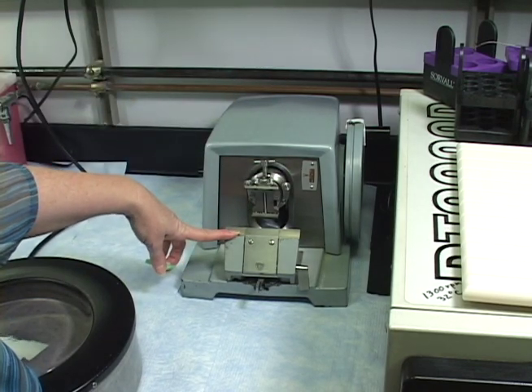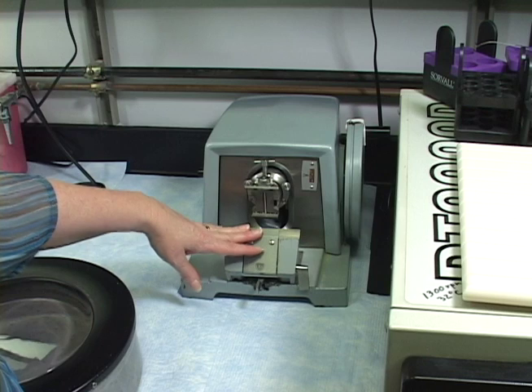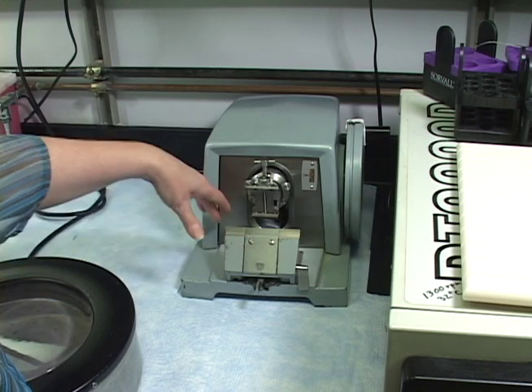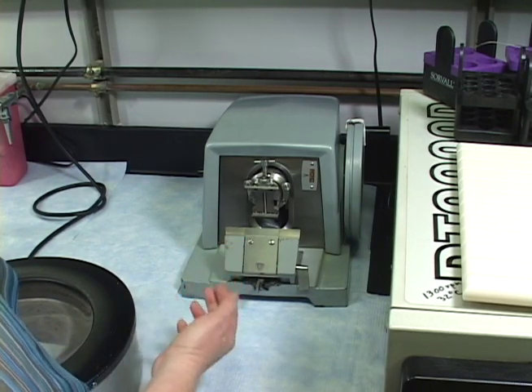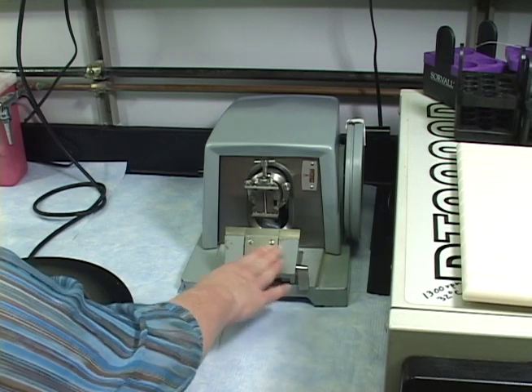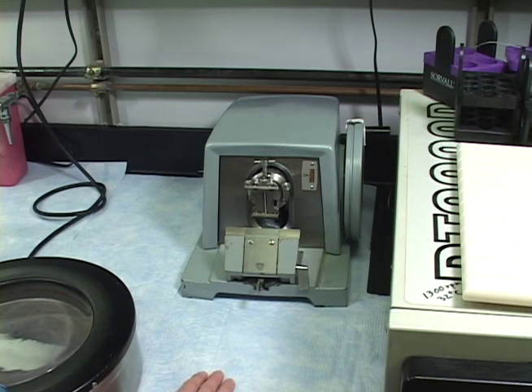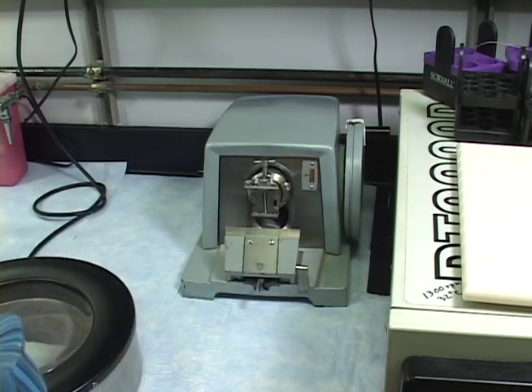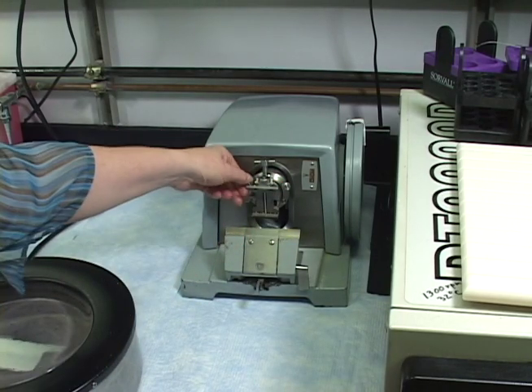Now on these microtomes, our knife tilt angle is fixed. On newer microtomes, that knife tilt angle is not fixed, and you have some options for adjusting that according to the blades you're using and other things. And the place that you're with will have an established parameter for that. For us, our only way to tilt anything is the block. Once a knife angle is set, even at any other place, you want to keep that more of a fixed parameter and never really adjust or mess with that. You're only really going to adjust the actual block face itself. So I encourage you again to fool with this and get adjusted to how you would tilt that, and it's kind of nice that we have this for you to play with.